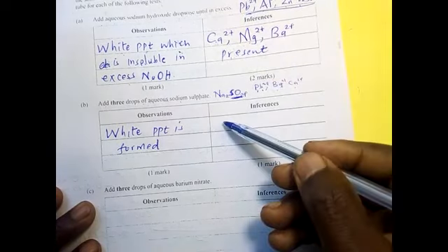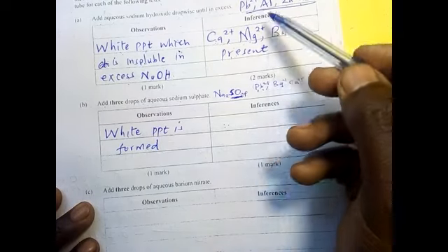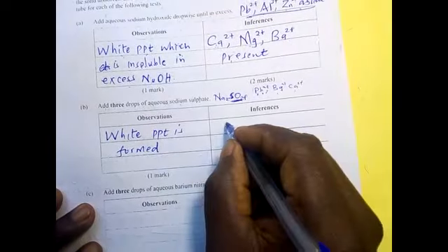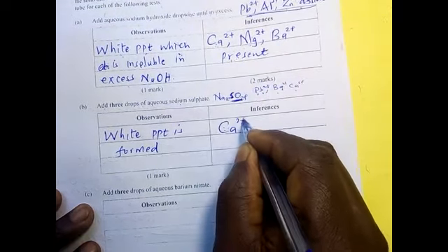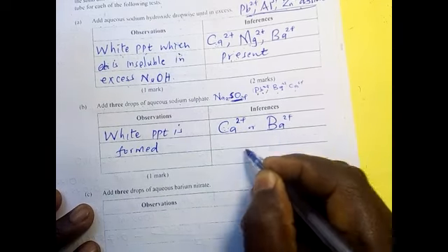Where will you get it from so that you can put it here? Therefore, you don't add that, because it was not there initially. Therefore, here it is only calcium and barium that are present: calcium 2+ or barium 2+ present.